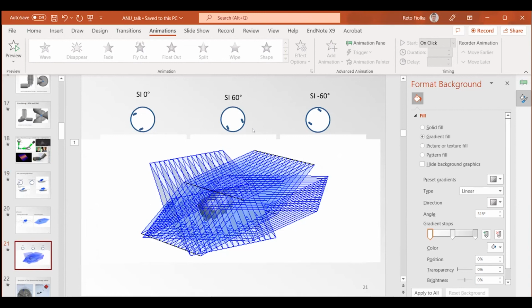And I guess with the alignment as well, I know even with a 2D SIM or a 3D SIM, the alignment can be quite sensitive; you have to get it quite precisely right. Yes, that is correct. If you have a TIRF SIM and all of a sudden one order is clipped or falls into epi, yes, that is correct. What shall I say? It makes it not easier, that's for sure.